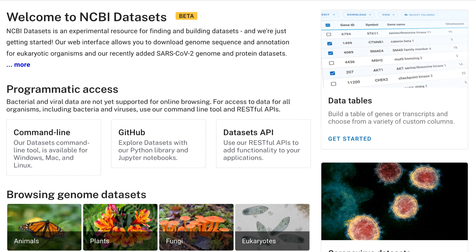This new resource supports intuitive and flexible access to genomes and genes for a broad range of taxa. We will introduce Datasets and provide a tutorial for both web and programmatic entry points. This Datasets homepage provides a description of the project and quick entry points to all data and services.